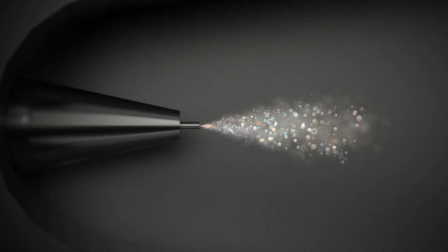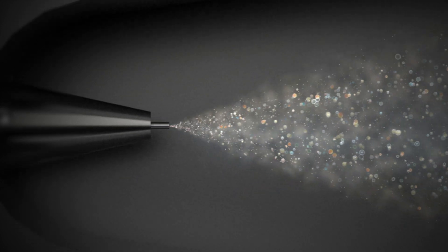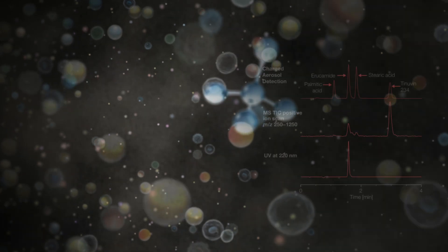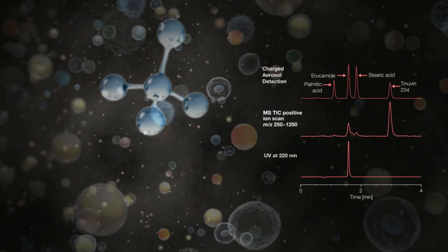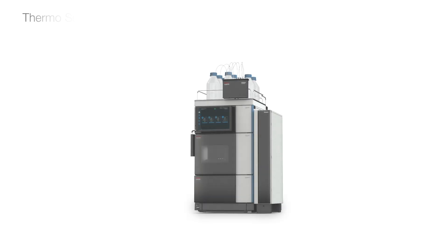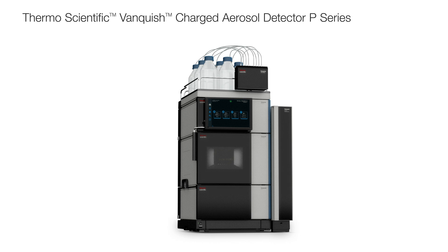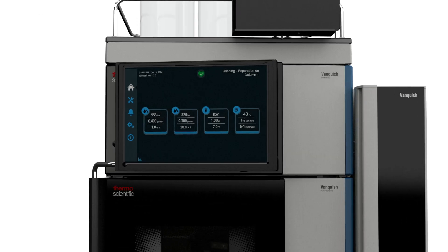When using HPLC to analyze compounds that don't have chromophores or can't ionize, traditional UV-Vis and mass spectrometry detection aren't dependable. Charged aerosol detection, now available as the Thermo Scientific Vanquish Charged Aerosol Detector P-Series, gives you near-universal detection and access to more information about complex samples. The application versatility of the Vanquish CAD-P series lies in the mechanism of detection and evaporative technology design.